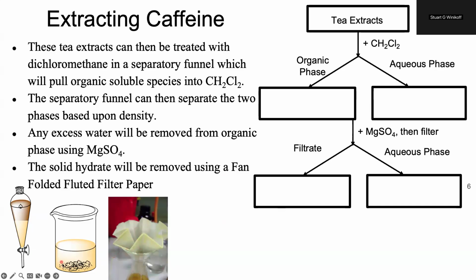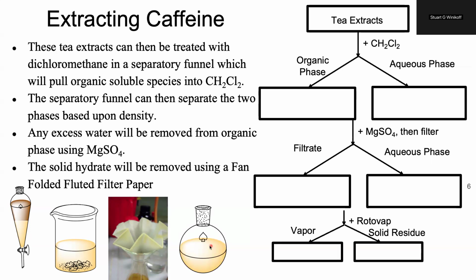So I can remove all that extra hydrated magnesium solid, and the only thing left behind should be my nice organic phase.